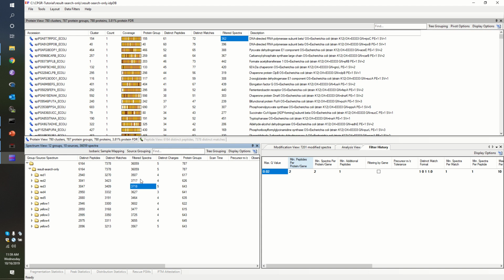I want you to think about how reproducible you are at the bench, right? Are you a robot? You are not a robot. Are you measuring exactly 20 microliters this time and every time? No, it was 19 this time and 21 the next, and so on. Human variation and mass spec variation together can lead to some rather large swings in what identification sensitivity is across these experiments.